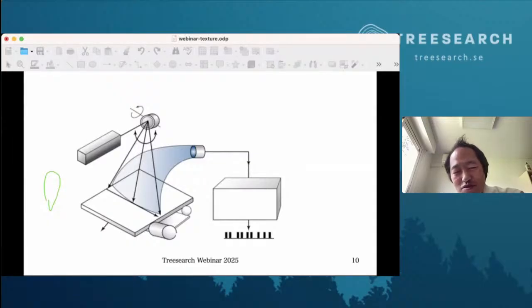The way we convert the X-ray that is stored on the imaging plate to digital data is also a very simple system. You have a laser, a red laser source, and you have a moving mirror that is scanning in one direction while the image plate is rolled in another direction. So you get a grid pattern of the intensity from the energy which was stored in the image plate, which emits visible light, and you have a photomultiplier to just detect the emitted light intensity. This is also a very simple system that is used in veterinary imaging or dentistry. If you go to the dentist, you have a similar type of system. In many dentists, they have a similar system.